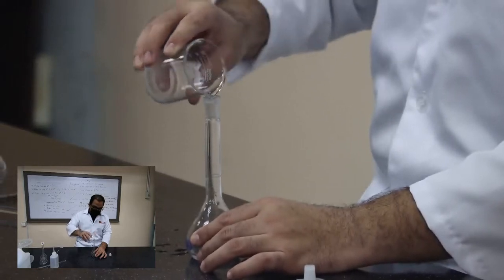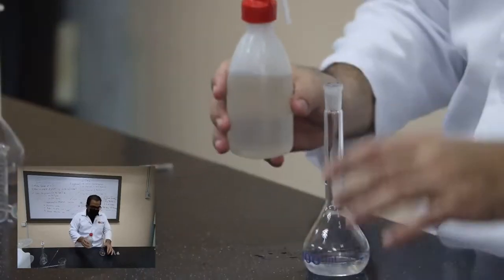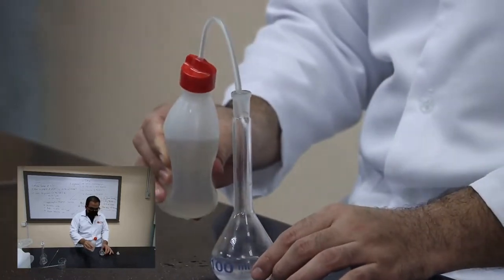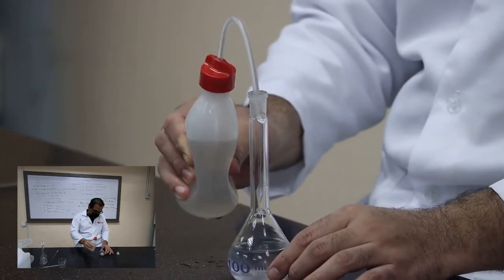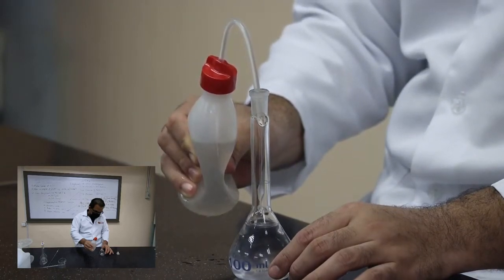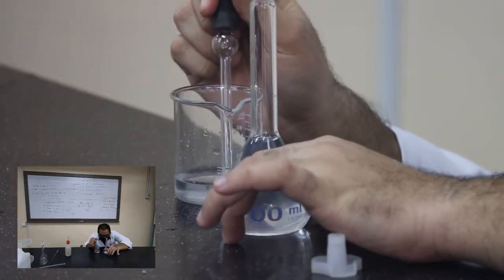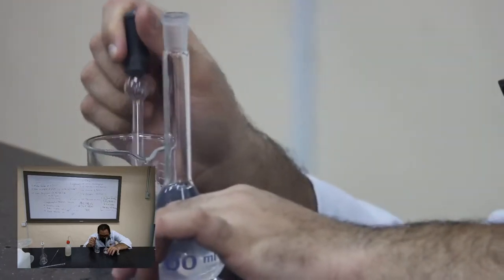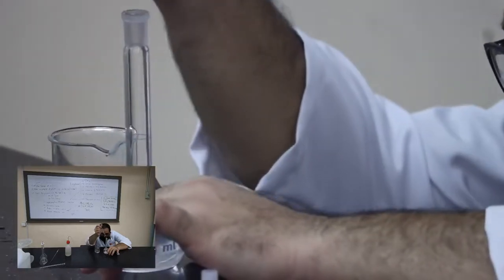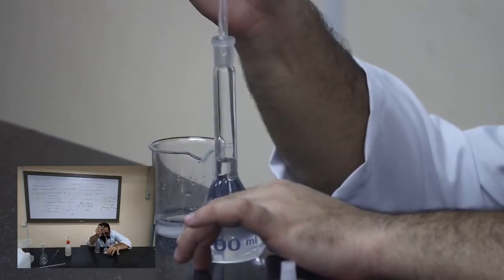This is how it is going to be done. Then we add deionized distilled water into the volumetric flask up to the mark. We have to be very careful. We have to make sure that we have eye level observation. Now, since it's coming to the mark, I have to stop. I have to make sure that I am at the level. Now I'm transferring a small amount of deionized water using the dropper to make sure that the meniscus attains the mark that I want.